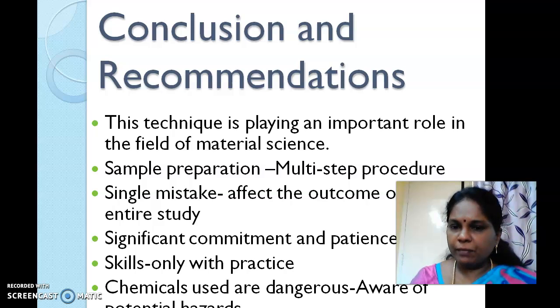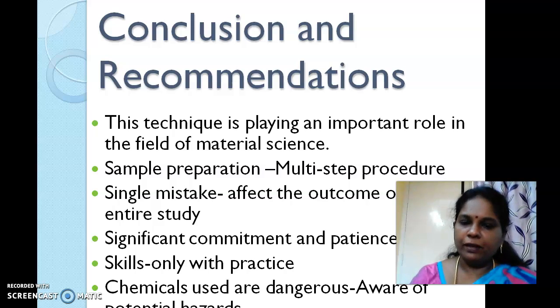Even a single mistake may lead to a wrong outcome. Therefore, full commitment and patience is required. Skill is needed, and also we must be aware of the fact that the chemicals used for sample preparation are hazardous and dangerous. Even with this limitation, TEM is a good characterization technique used by most material scientists.